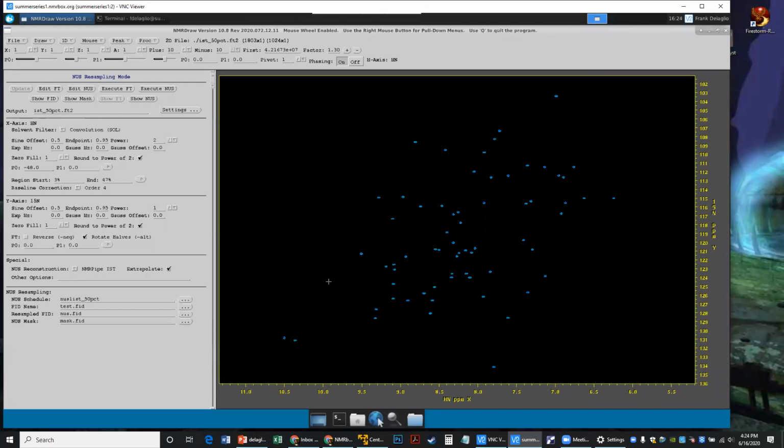So Frank, tying into what we started, this is exactly the way I can test the user's fully sampled or uniformly sampled data to demonstrate to myself or the user, hey, look at what's happening here, correct? That's exactly right. Yep, that's exactly right.